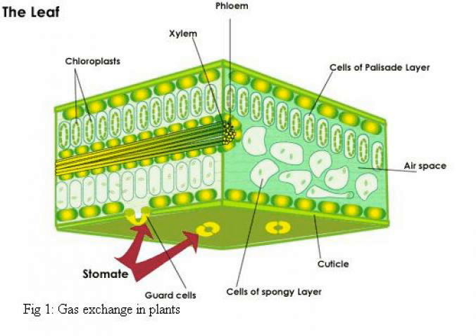2. Using a ruler, measure the length of the leaf from the base of the leaf, not the stem, to the tip of the leaf. Record this information in millimeters on your lab handout. 3. A spot on the top side and underside of each leaf should be painted with clear fingernail polish. A spot approximately the size of a dime or nickel is sufficient to provide enough leaf surface to make the count. Choose a spot that does not contain any of the veins of the leaf.